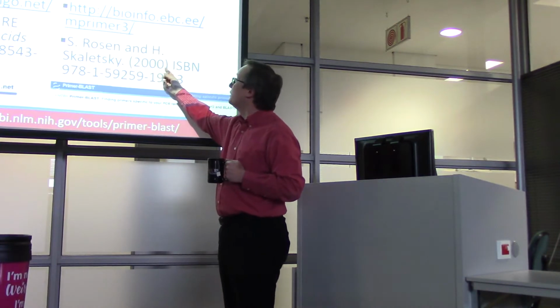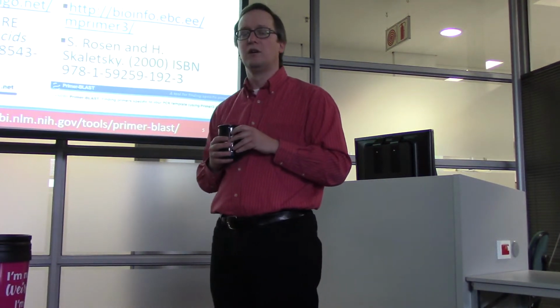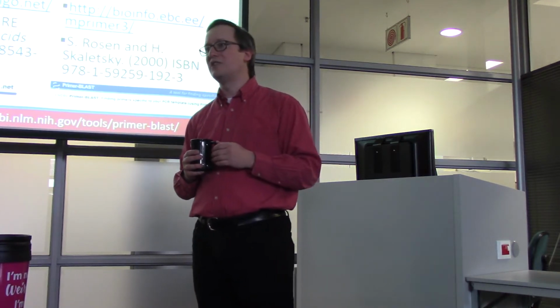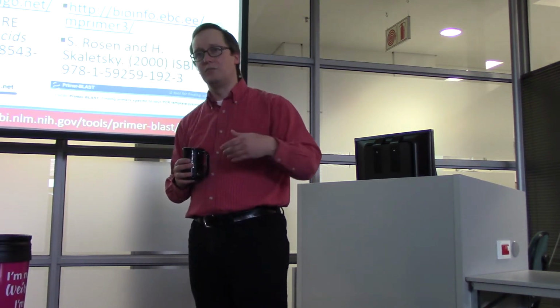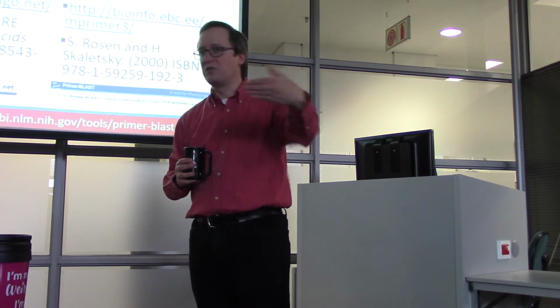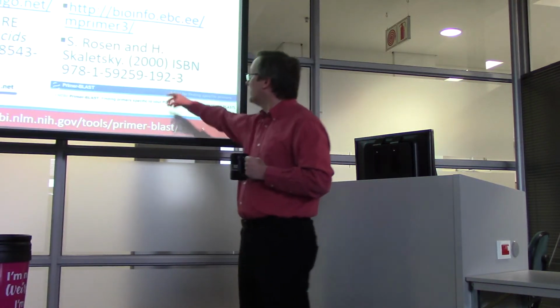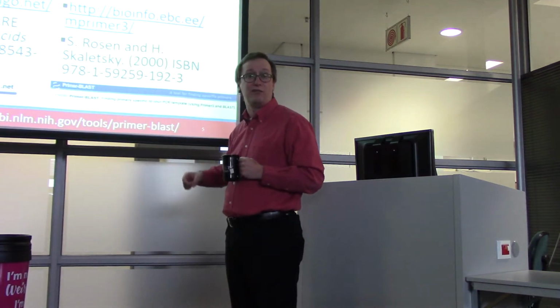On the right, we have an open source toolkit for this, the Primer3 software. An open source tool doesn't come with support like that. Generally, their support is dependent on a community of users rather than some company with people paid to provide support. And if you really hate some feature of it and feel that you could do it better, you can actually make changes to it yourself.